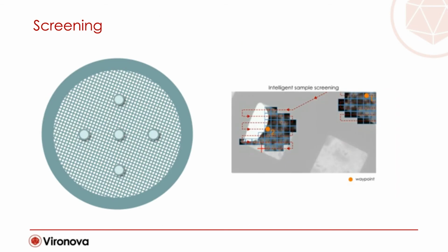So I'm now going to guide you through the automated procedures in which the system works in order to collect and provide meaningful and accurate data of a sample. And we're going to discuss how this data and output can be representative for the sample and ultimately the product being analyzed.